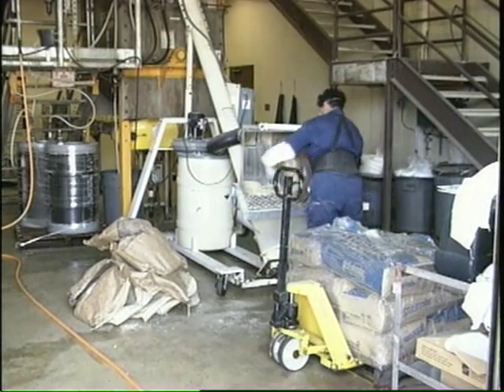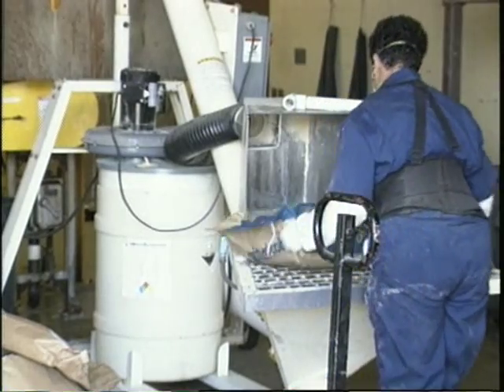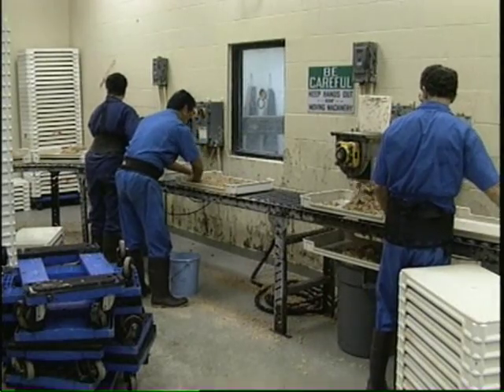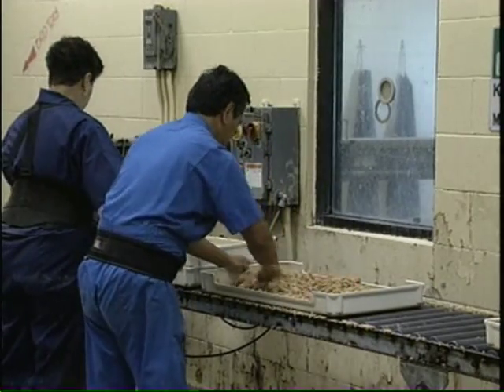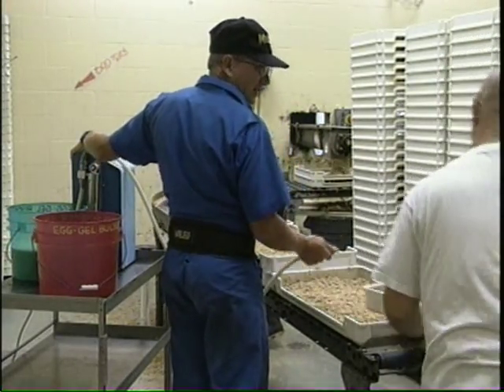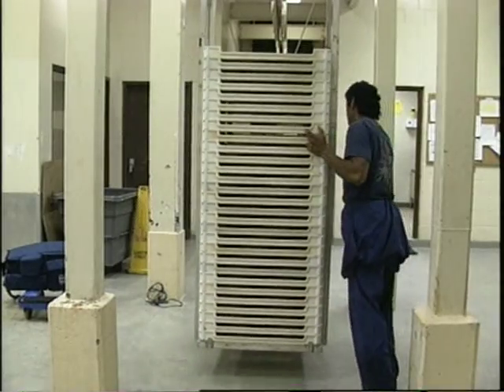One mixer is capable of preparing 4,000 pounds of diet media. The diet consists of bulking agents, sugar, yeast, chemical preservatives, and water. Other additives may include antibiotics and acid for pH adjustment. Florable diet is deposited into the trays. At full production, 1,320 trays will be prepared each day. Eggs suspended in a gel mix are sprayed onto the diet with an automatic pipette. Trays are placed on a monorail transportation rack and moved into another room for incubation.